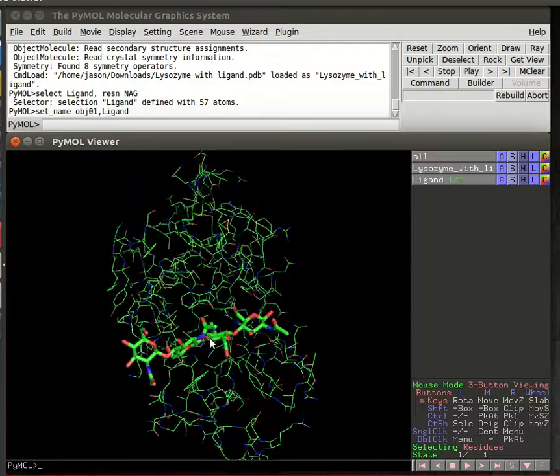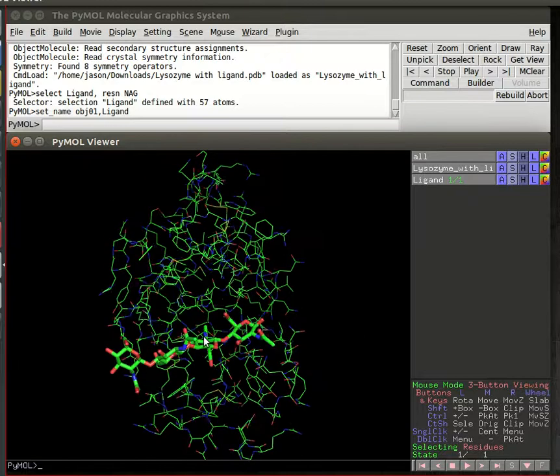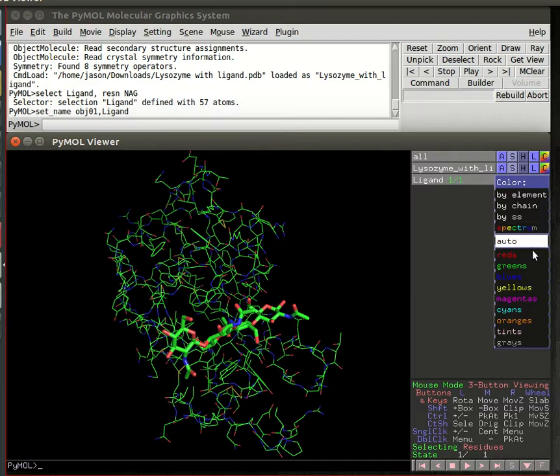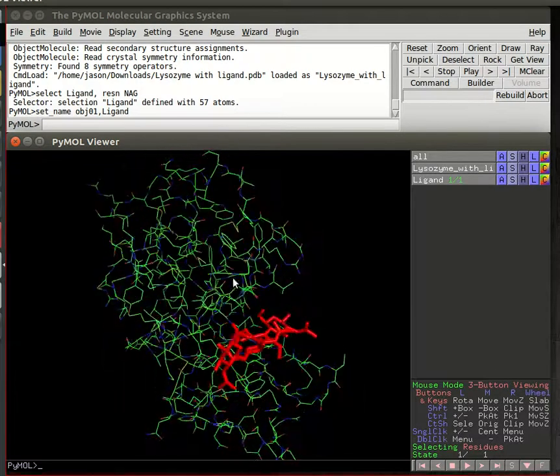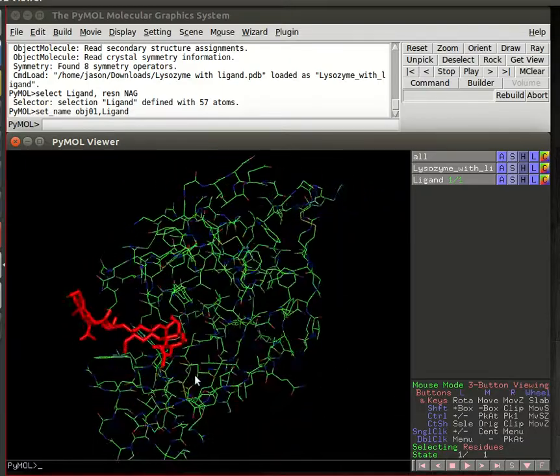Okay. Now, it's maybe a little bit gaudy. Atoms are automatically colored in PyMOL based on the PDB and what those atoms actually are. Let's maybe change that. We're just going to make it flat out red. So our ligand is now maybe more contrasty against the background. So far, so good, I think.